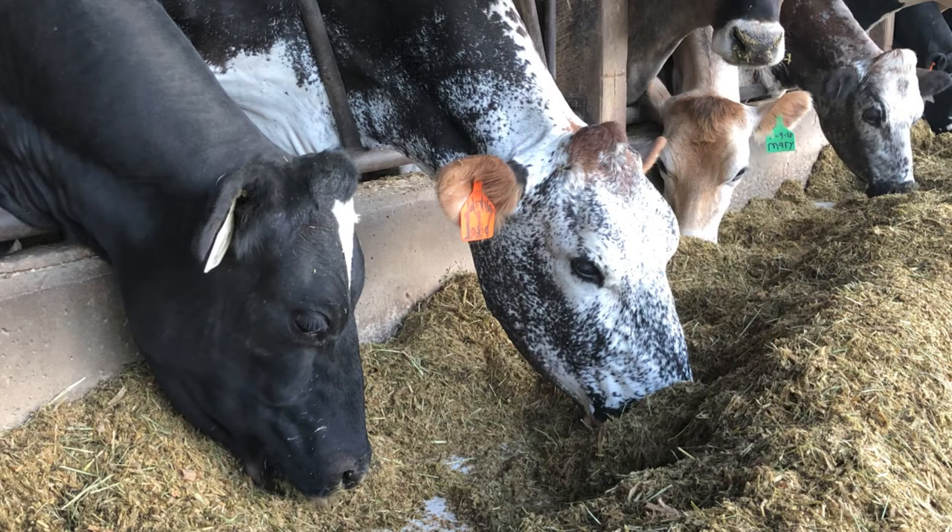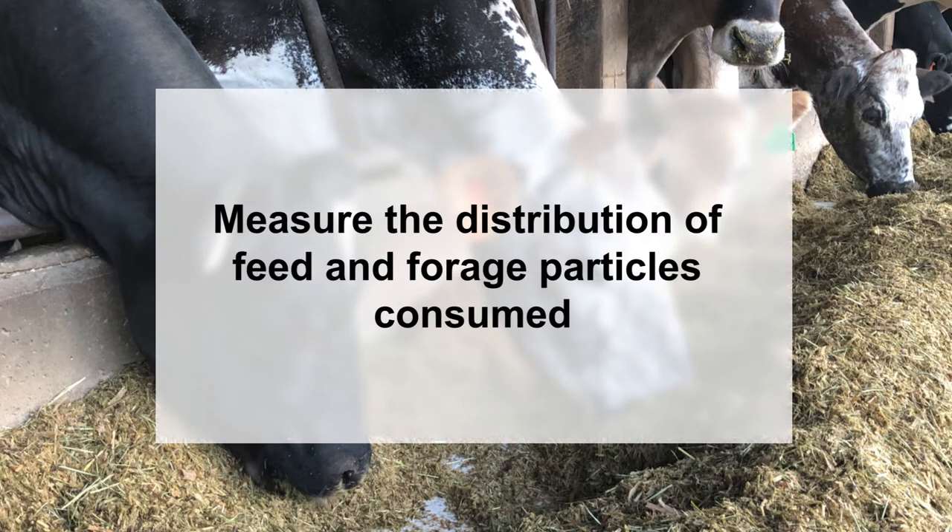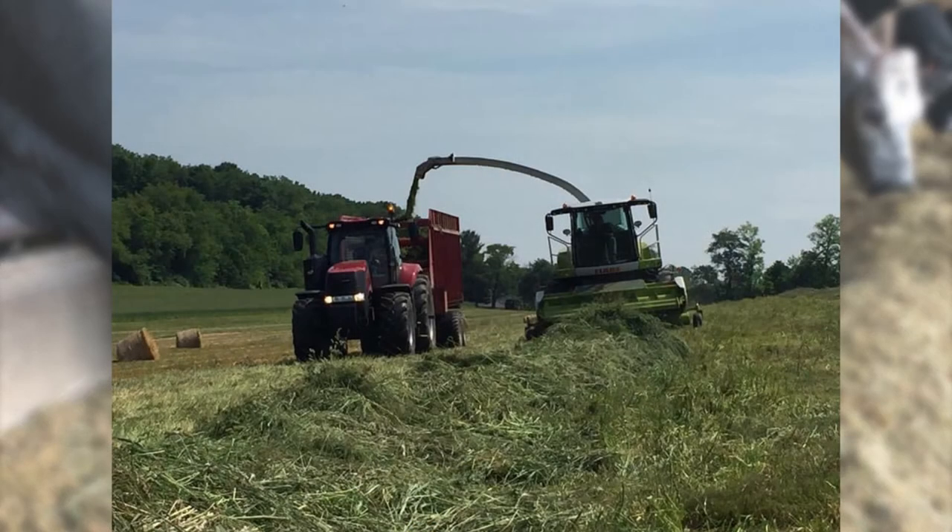One of the primary goals of analyzing the particle size of a TMR is measuring the distribution of feed and forage particles the cow actually consumes. Adequate forage particle length is necessary for proper rumen function. Since particle length of forages is first determined in the field, the PSPS separator is also used to measure particle size of forages at harvest, which can alert producers of potential problems with harvesting equipment and allow them to make appropriate corrections.